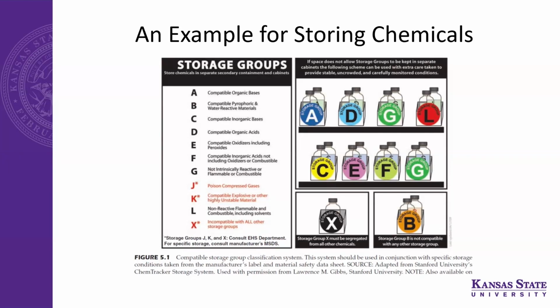However, there are classes which should not be stored together. For example, chemicals which are incompatible with all other storage groups should be kept separate all the time.